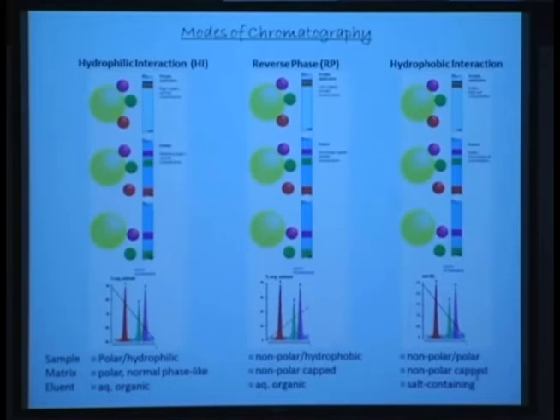Reverse phase ion pairing. So reverse phase, I forget, or not ion pairing. We'll talk about ion pairing a little later. It's primarily reverse phase. So in here, what is done is that you have your carbohydrate molecule.